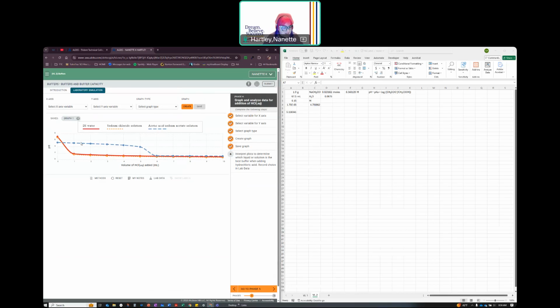So I think that the best buffer is the acetic acid sodium acetate solution because it resisted changes in pH up until we hit about the 5 mil mark. And then we hit this place where we stopped resisting change. So that is where we ran into that issue. So right there.